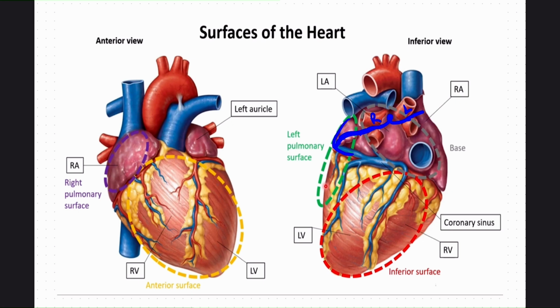This is the atrial wall. This is obviously the inferior surface. The posterior surface itself is the inferior surface, and it's the inferolateral aspect of the left atrial wall. And you extend this cut, staying posteriorly, you cut through the posterior bicuspid valve, the posterior mitral valve, and enter into the left ventricle.